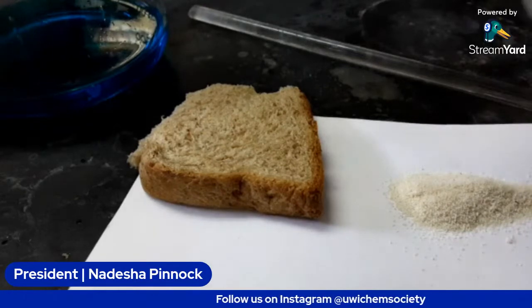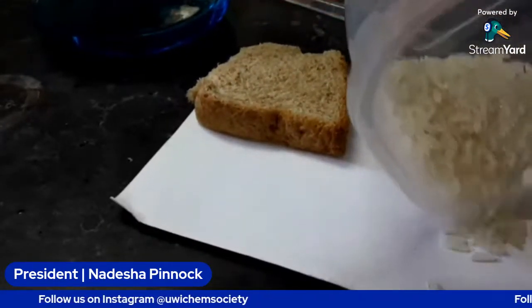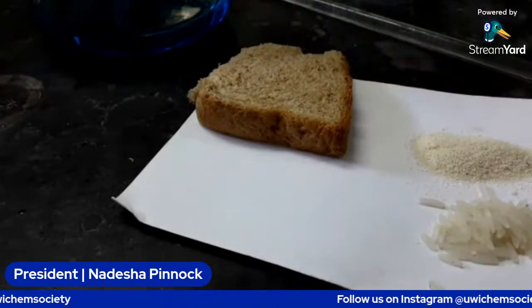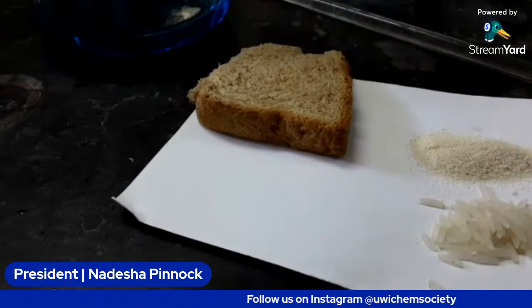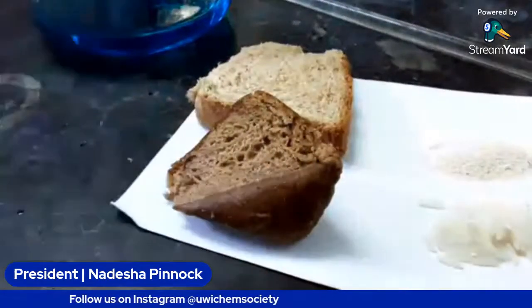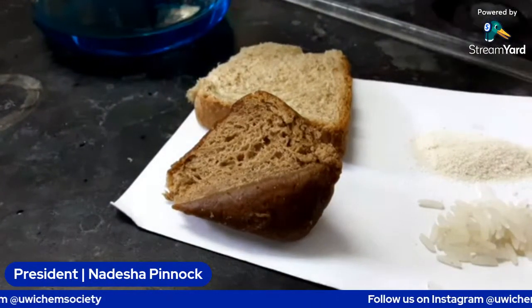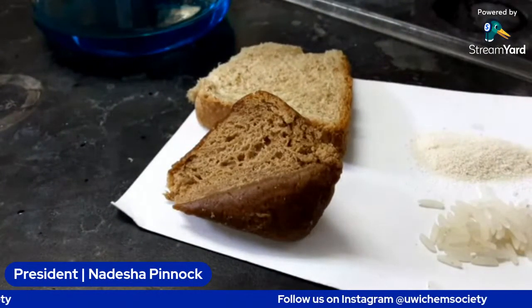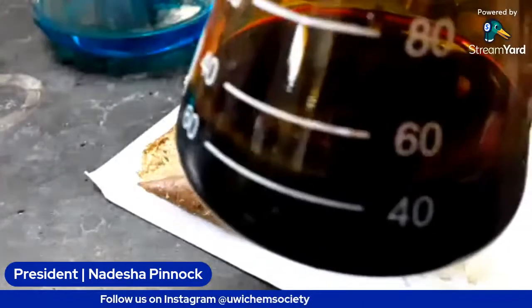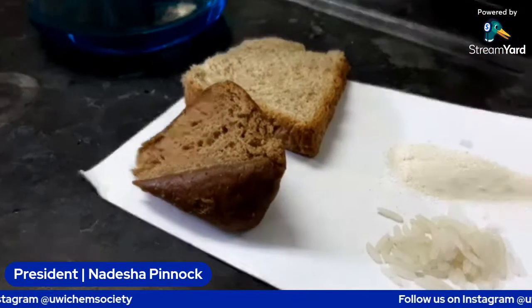This is the rice. Okay. And we're just going to use our test tube to add about 1 ml of our Lugol's reagent here to our samples.